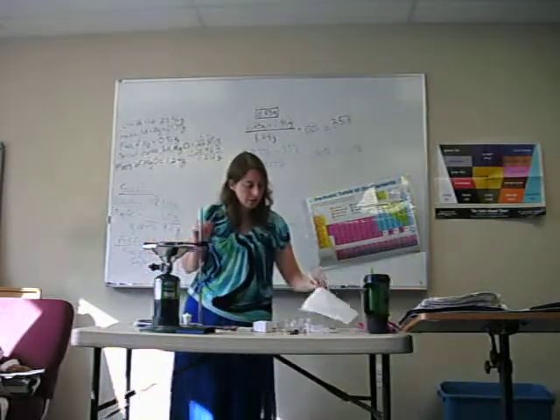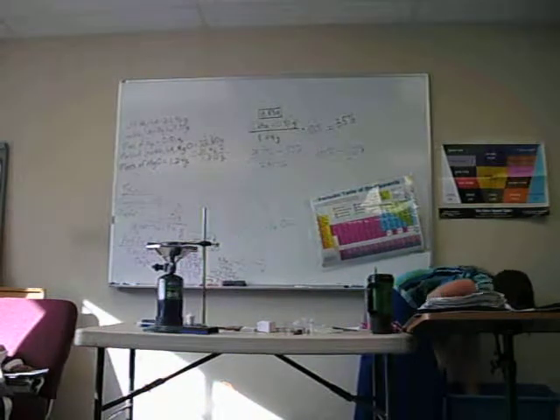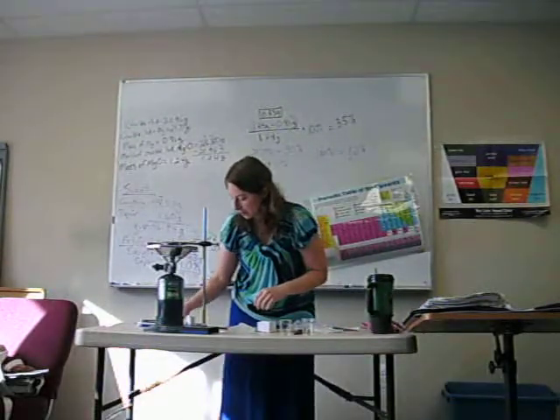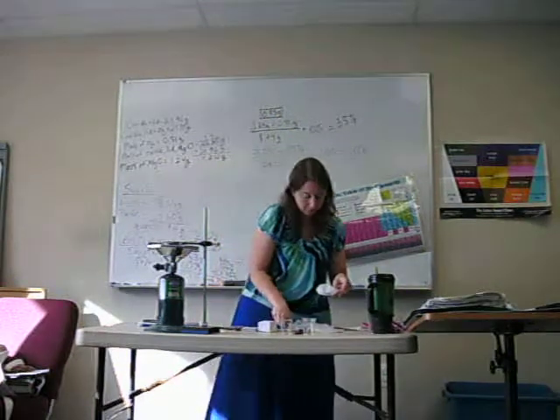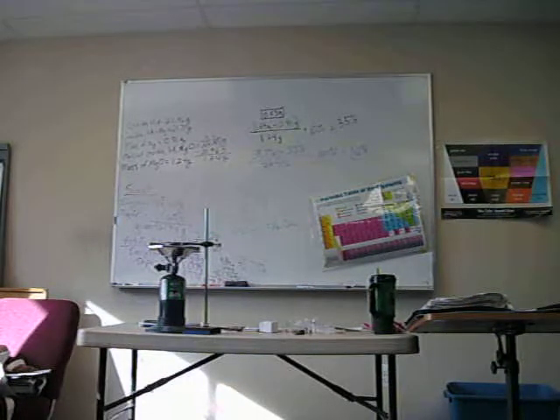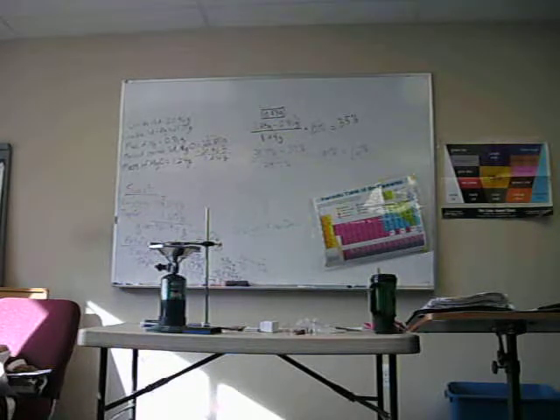And then let's see if I have another little tissue in here. Yep, I do. So, now that we've gotten the mass and we don't need this anymore, I'll pour out the contents and we can have a look to see why we've got so much error. My guess is that about 12% of my metal didn't react because it got coated. And you can see there's a little core of metal in there, right here, that didn't get reacted. If it crumbles, it probably all reacted.